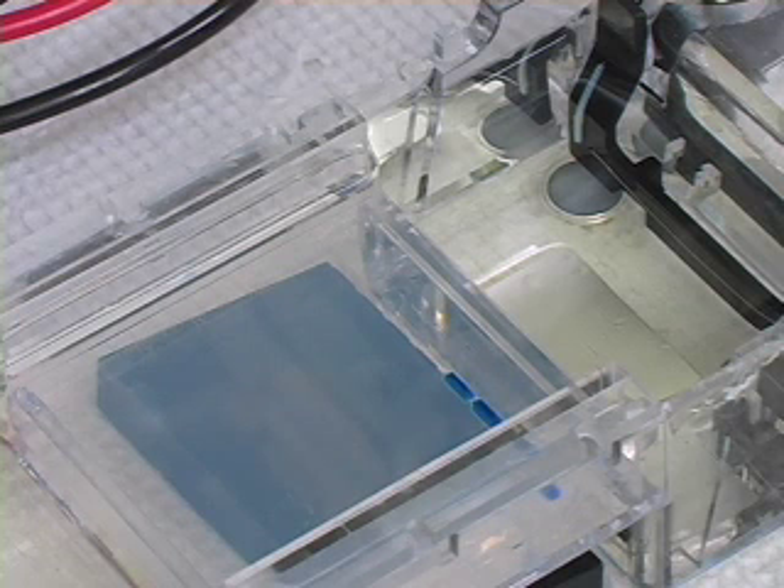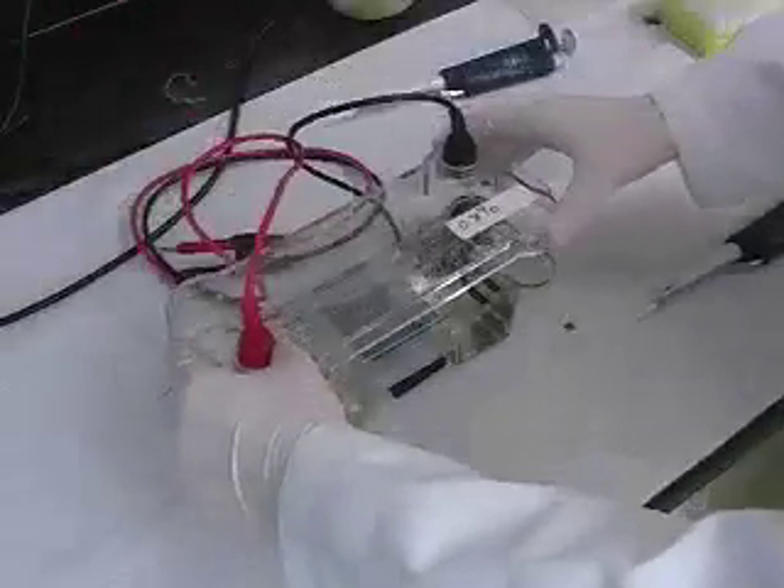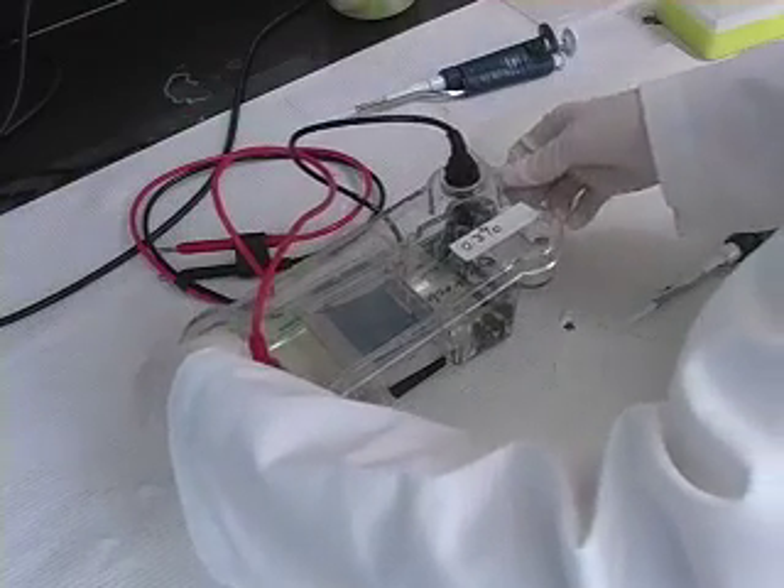A gel with samples properly loaded looks like this. Attach the leads — red to red, black to black. Make sure the wells are opposite the red or positive lead, as the samples will run to red.